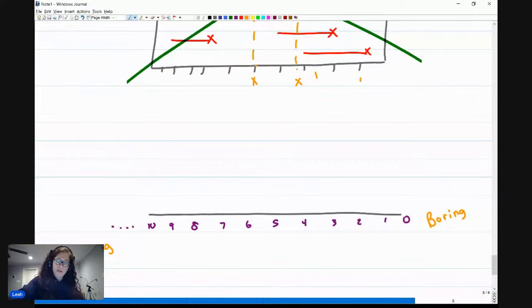the boring side. And with that in mind, here are the major groups that you are going to see when you're looking at graphs. If you have just carbon and hydrogen, it's going to show up around here, around the 0 to 1 range, depending on if it's a methyl or an ethyl, and not a lot more going on next to it. For example, just a long carbon chain or a branch on something that doesn't have anything exciting.